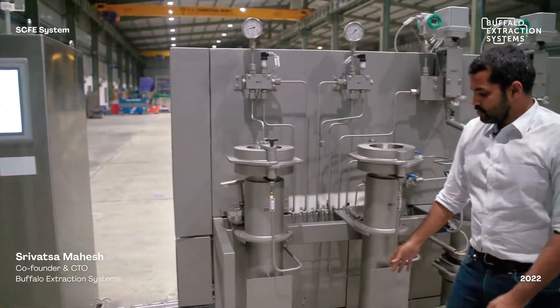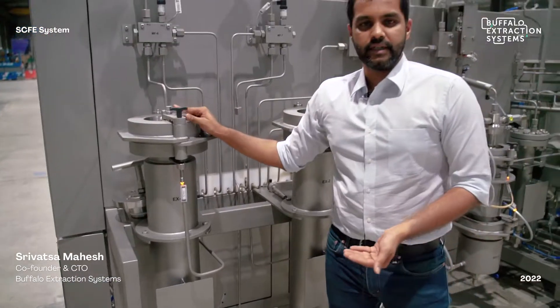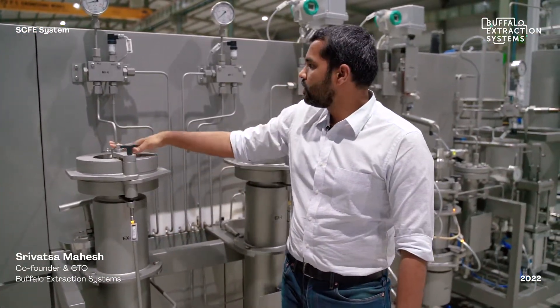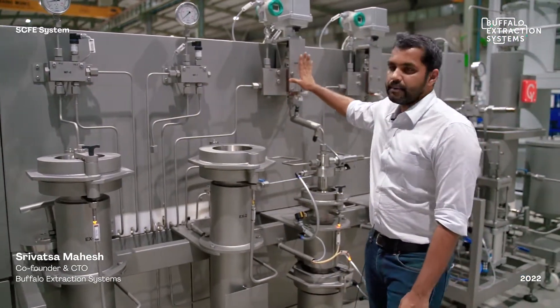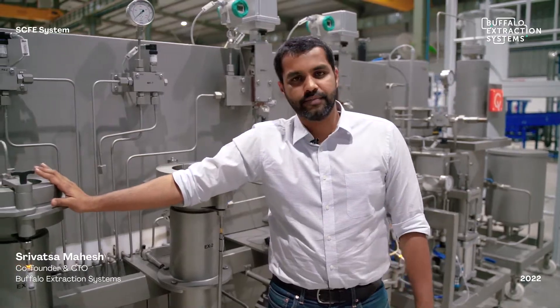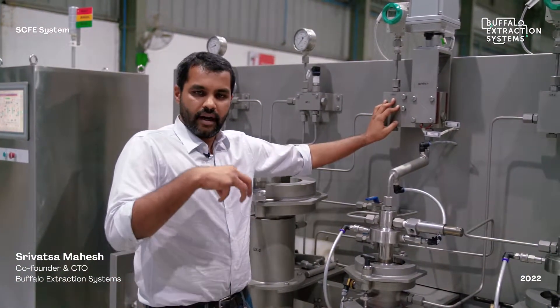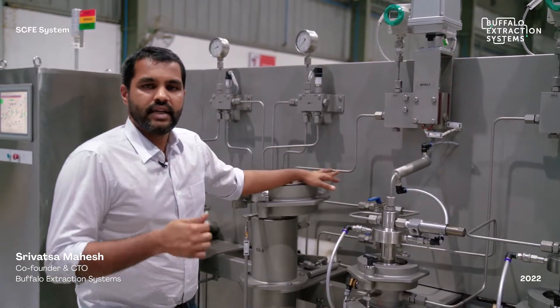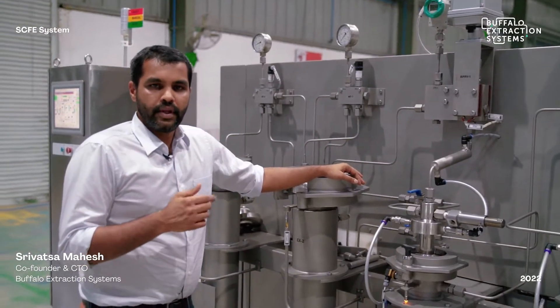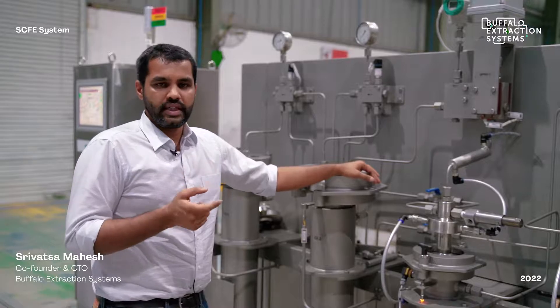The CO2 passes through the extractor from bottom to top in a supercritical state, carrying the oils with it. It then goes into a back pressure regulation system, which is a servo-actuated pin valve controlled by a servo actuator, ensuring precise control of extraction pressure within a tolerance of about 2 to 3 bar.